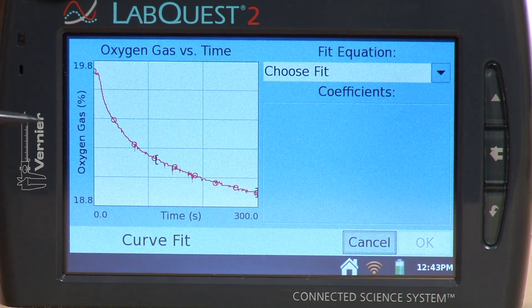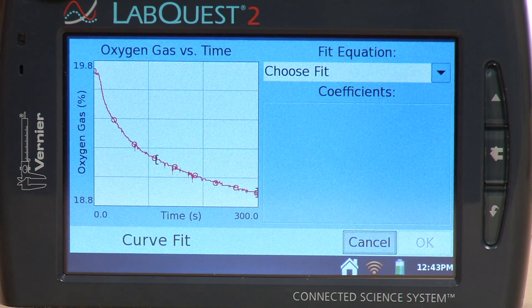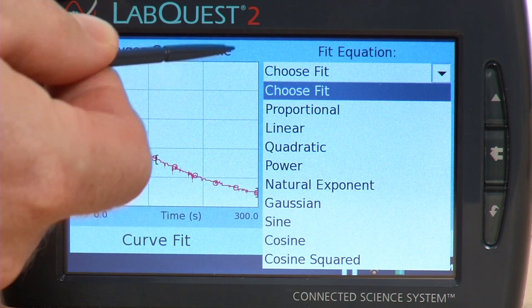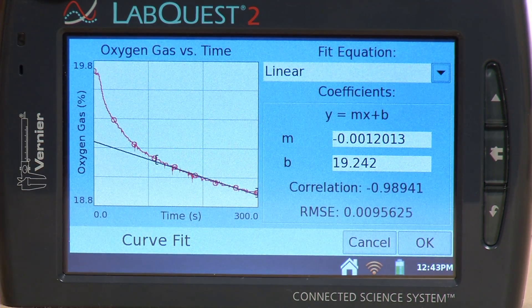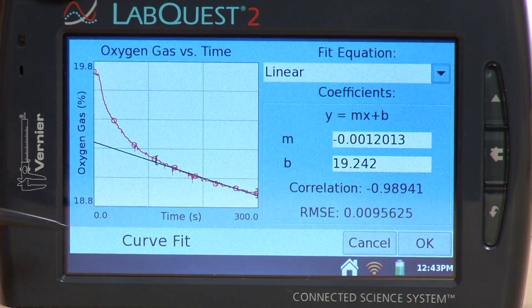Select there. And then there's little brackets there, and it's asking me that I want to try to use those data. So I'm going to go up to where it says Choose Fit, and tap Choose Fit, and I'll do a Linear Fit there. And it looks like it gets a pretty nice little correlation there. So I hit OK.